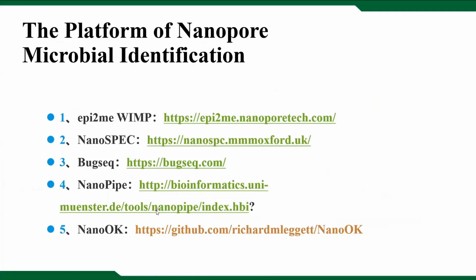Then, for Nanopore 16S data, many tools and online platforms have been released for data analysis, including EPI2ME, NanoSPC, BugSeq, NanoPipe, and NanoOK, and so on.